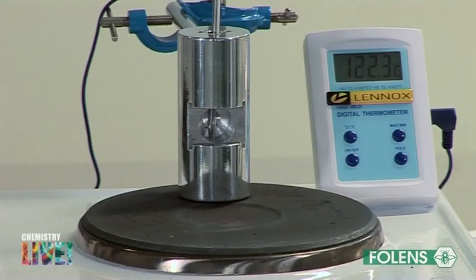Allow the aluminium block to cool and repeat the experiment using a second sample of benzoic acid. Take the average of the two readings as the melting point range of the benzoic acid. Repeat the experiment with an impure sample of benzoic acid and compare the results that you have obtained.